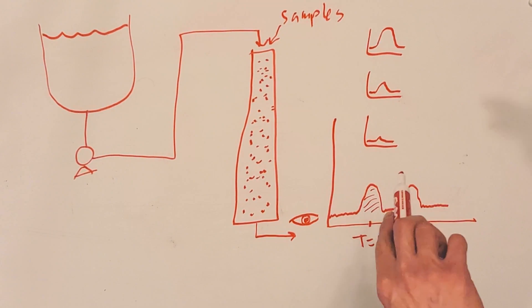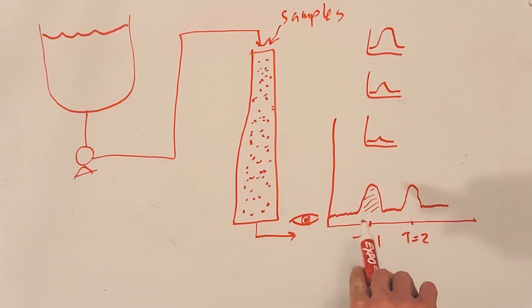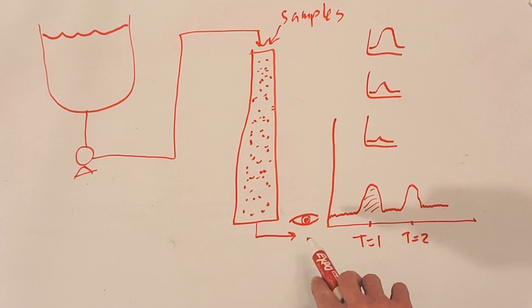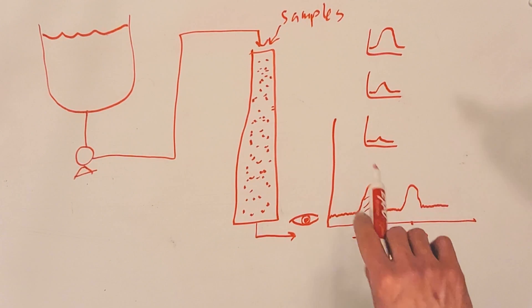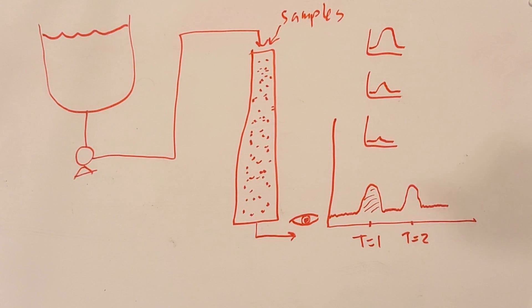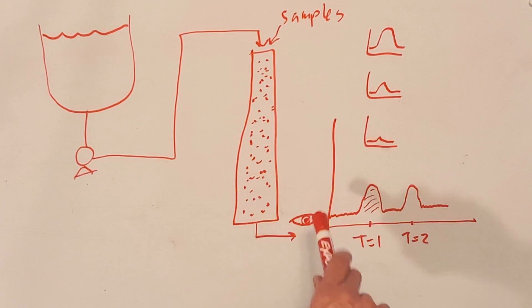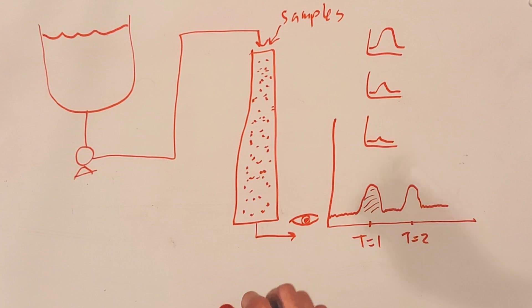This is what they do in alcohol testing, cannabinoid testing, pesticide testing — all sorts of quality control fields can use HPLC to tell you exactly how much of what compound is in your sample. That's the crash course on HPLC mechanics. Let's head on over to the lab and see what my crusty LPLC system looks like.